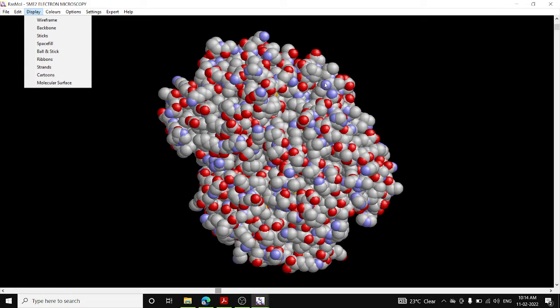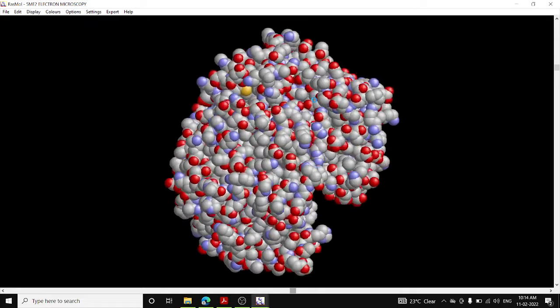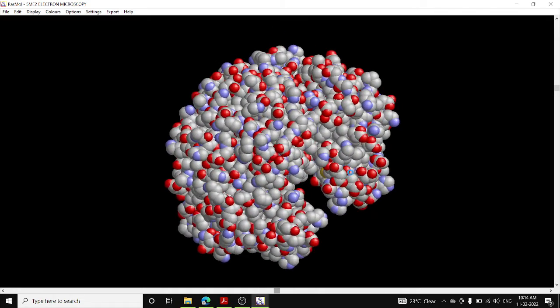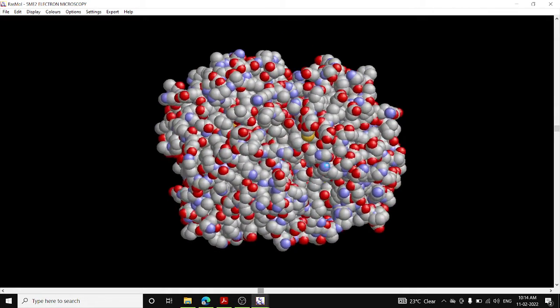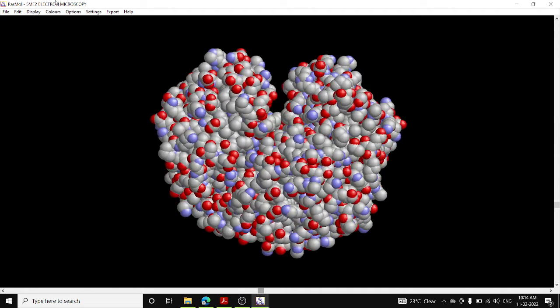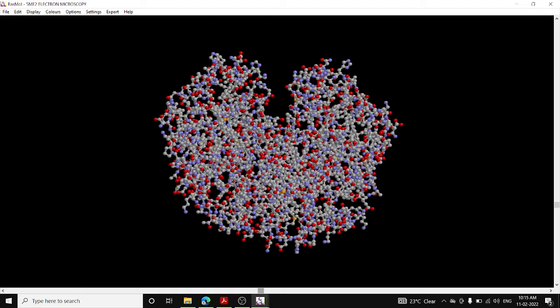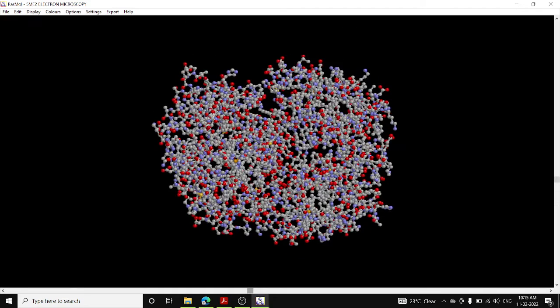And in the Ramachandran plot also, Ramachandran himself used that kind of model to understand the torsional angles, or how the angles are made. Then if you see the ball and stick model, that is quite easy.